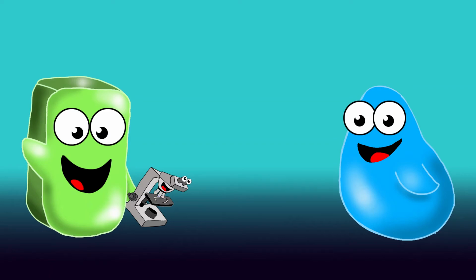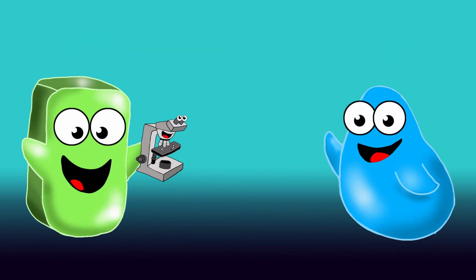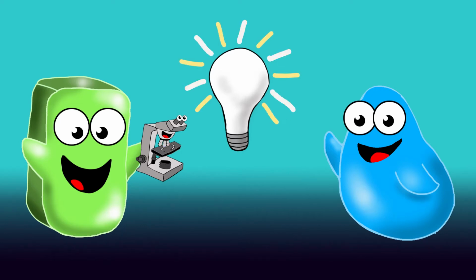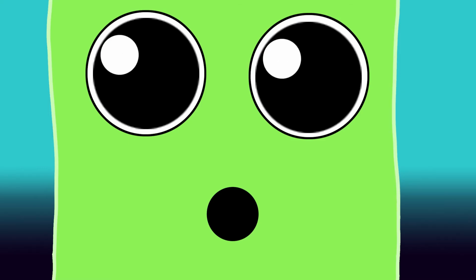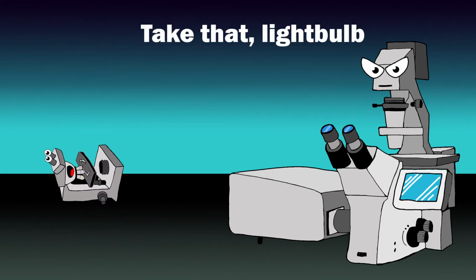Now let's learn about the confocal microscope. Is it like this one? Well, it is a type of light microscope like the ones we use in school, but instead of using a light bulb to see things, it uses lasers. Ooh, lasers. Pew, pew, pew. So how exactly do you see things with lasers?